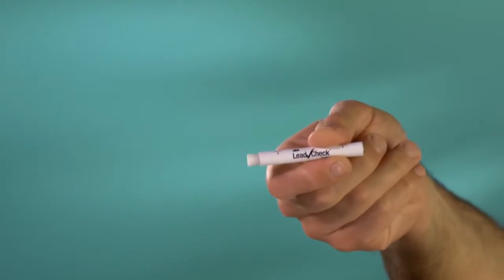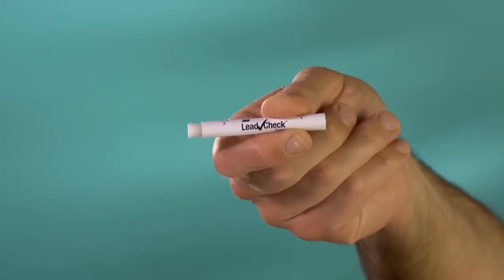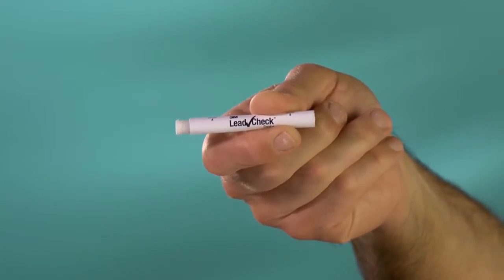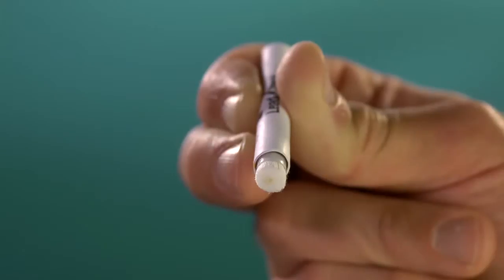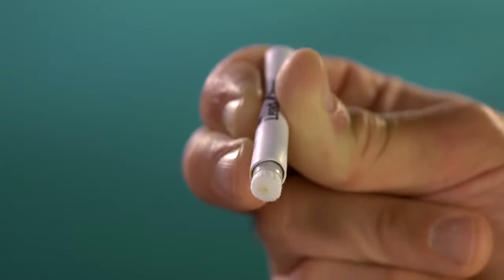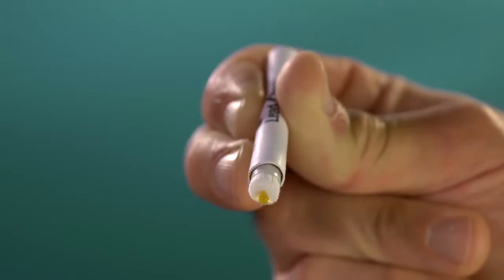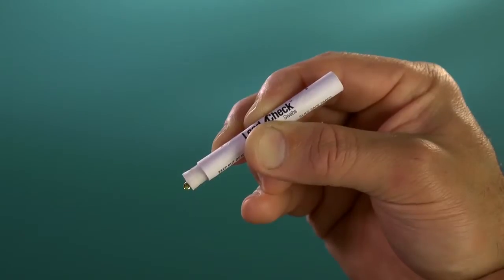Shake the tube vigorously for a few moments to be sure that the chemicals inside have mixed. The 3M LeadCheck swab is now activated and ready for use. Squeeze the tube until you see a bit of the reagent liquid soaking down through the fibers of the swab and appearing at the end of the swab tip.